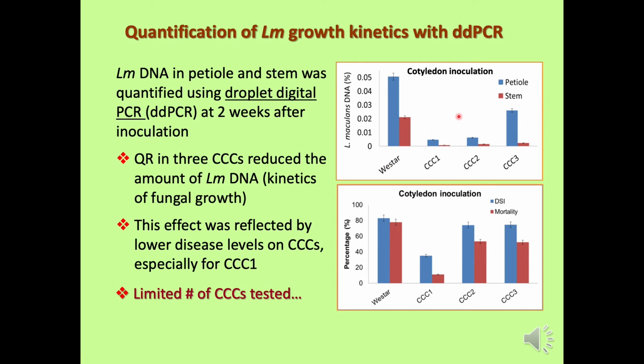And this amount of reduction in the pathogen DNA seems to be related to the disease resistance level with these varieties. And this is quite exciting. So we wanted to expand this study to include more varieties for this testing.